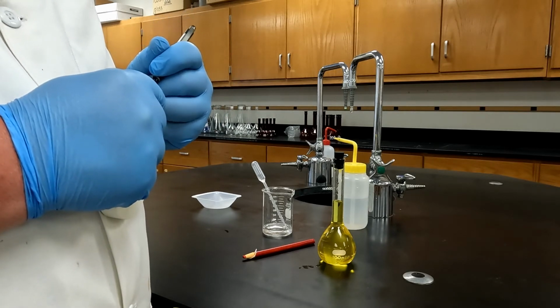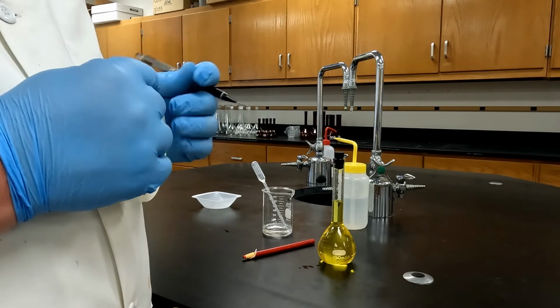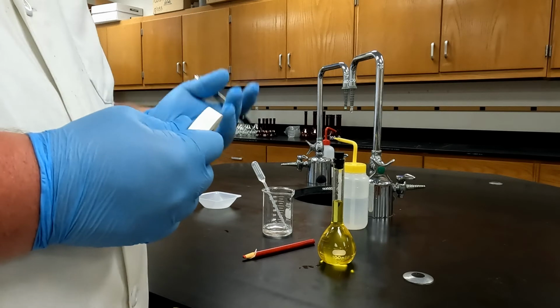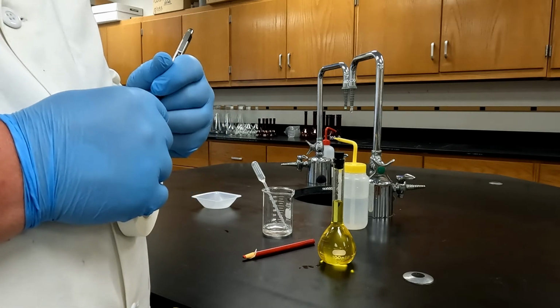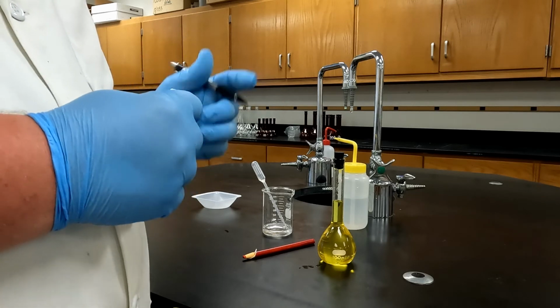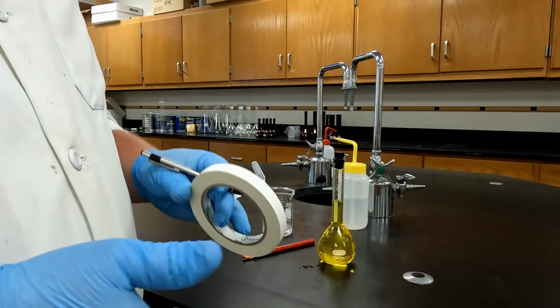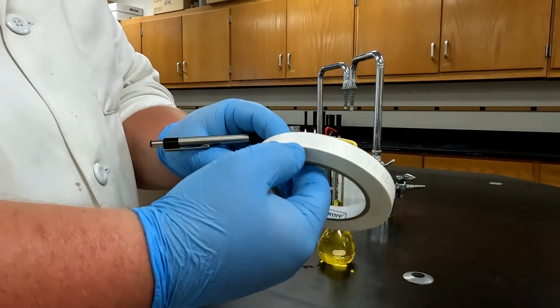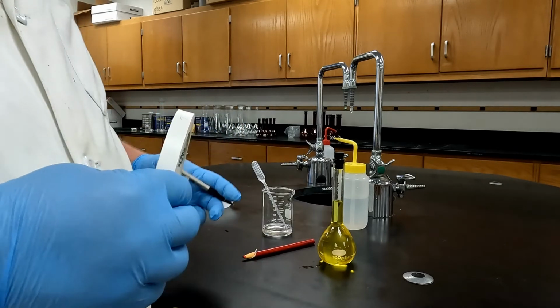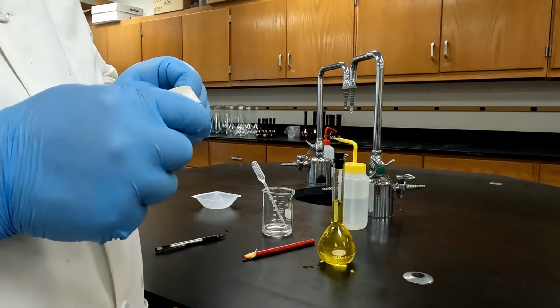The formula is K3Fe(CN)6. So I've labeled my calculated concentration, labeled the formula. I put today's date. And I initial it. So I put my initials. This will tell me anytime that someone uses this, the exact concentration, the formula, the date it was made, and who made it. So I'm going to peel off this labeling tape and stick it to the flask.